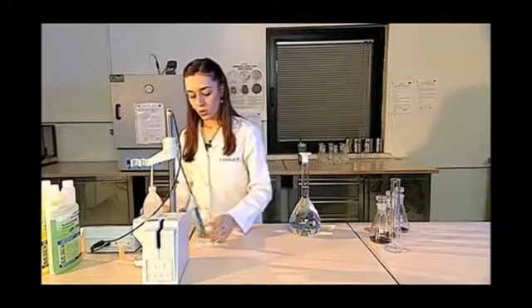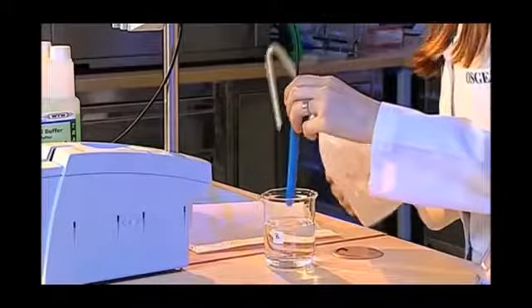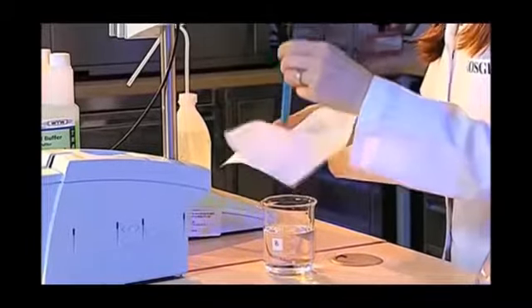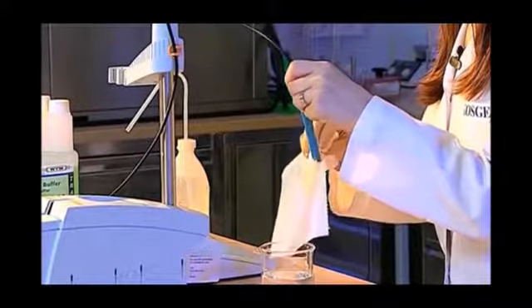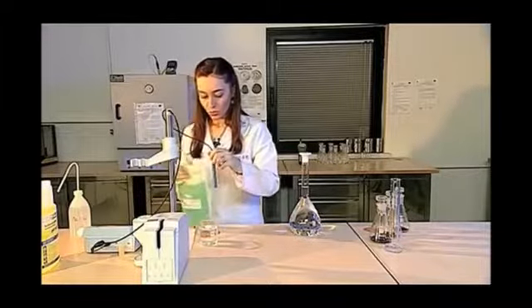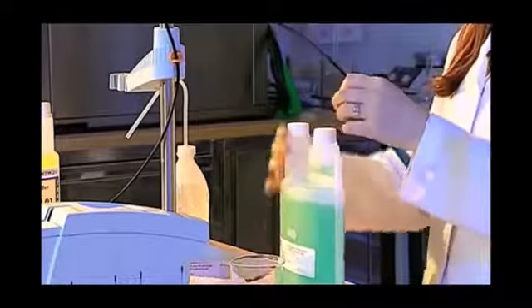I adjust the calibration of the pH meter to measure the pH of the potassium chloride solution that we have prepared. Therefore, we wash the tip of the electrode with distilled water first. Then, we slowly dry it with the edge of a napkin, and we especially make sure that everywhere is dry. We use pH 7 and pH 4 buffers for the calibration process.